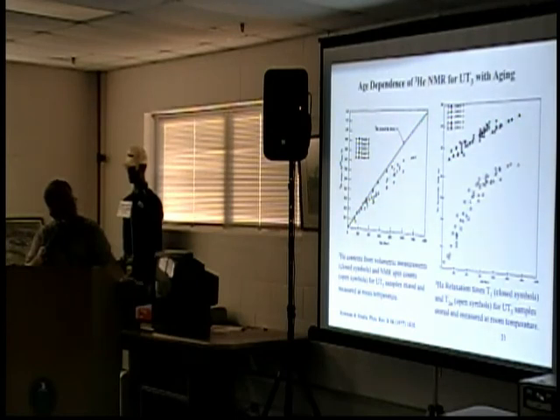These are the T2s, and they start out very different. Over a period of a few hundred days they become less different, though still more than an order of magnitude different here, down to about a factor of 5. Again, these were all measured, and the correlation is that as T2 approaches T1, the bubbles are getting somewhat bigger. We're seeing a growing size, and then they level off. They're leveling off here at the longest time.